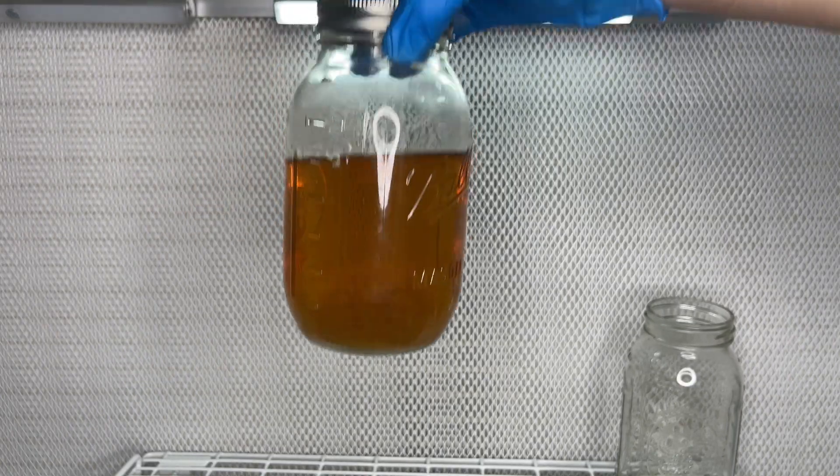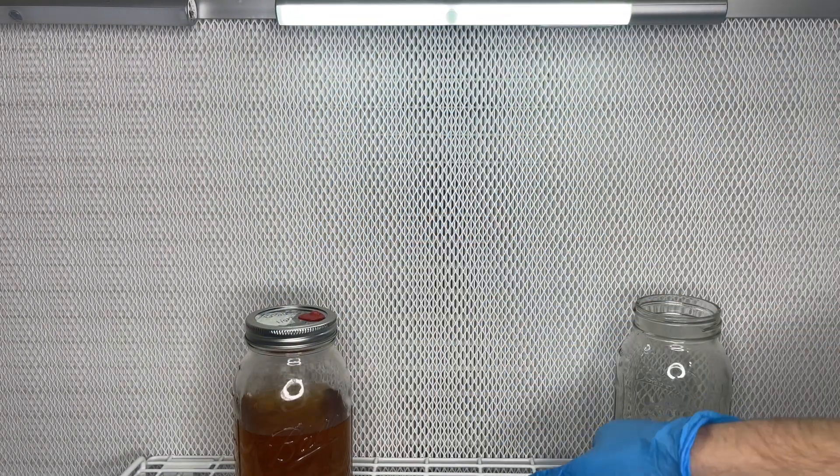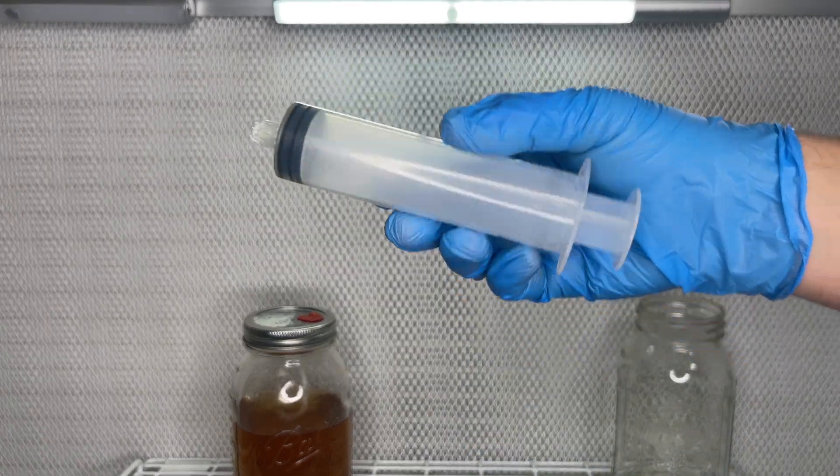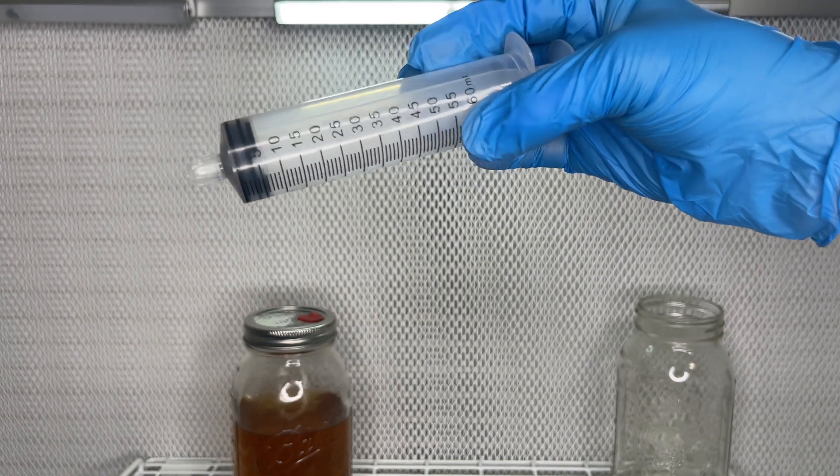Sometimes with certain mushroom species like lion's mane, the mycelium will only grow halfway through the jar, leaving a lot of extra liquid that will make it difficult to make thick liquid culture syringes.